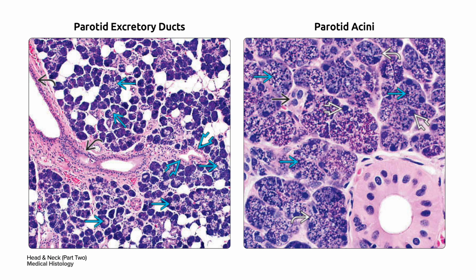On your right are the serous acini in the curved white arrow, which are spherical and drain into the intercalated ducts in the single black arrow. The secretory cells are pyramidal with basal nuclei in the curved white arrow, and the cytoplasm contains numerous basophilic secretory zymogen granules pointed out by the single blue arrow.